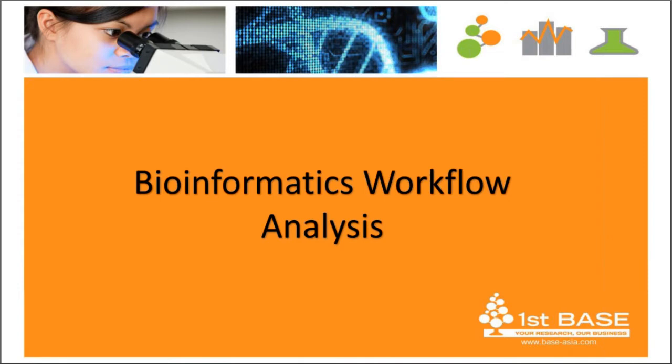Okay, so just to recap what we have done in our first session. We have introduced you to Amplicon sequencing, which is a part of NGS where we target certain genomic regions, for example 16S V3V4, 18S, or ITS regions. Then once we have completed the sequencing, we can start with the bioinformatics analysis.